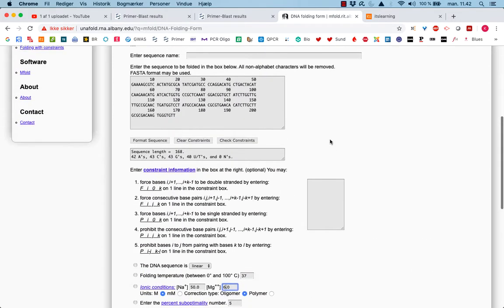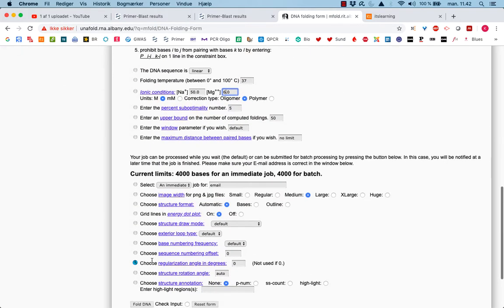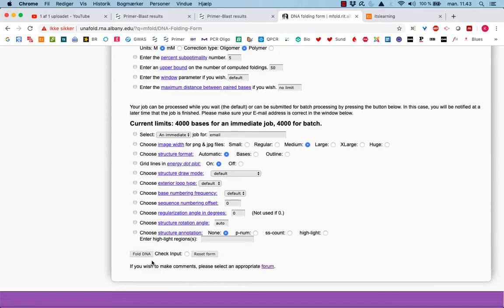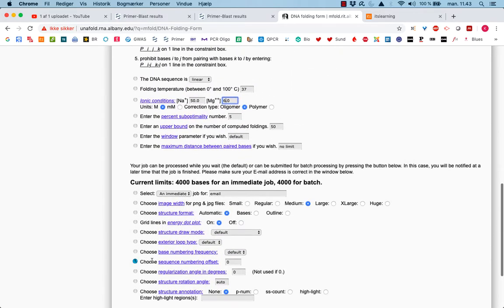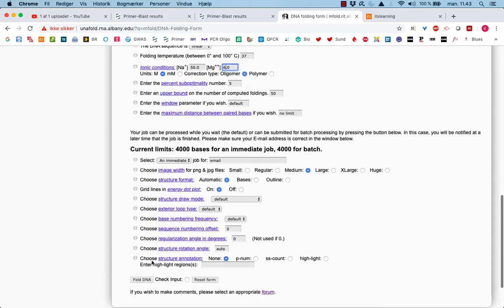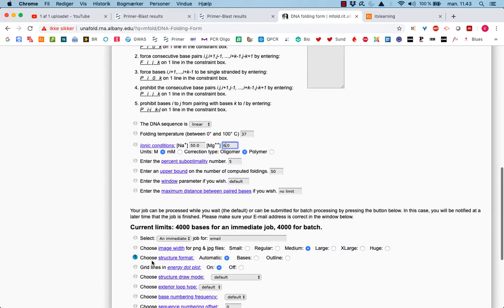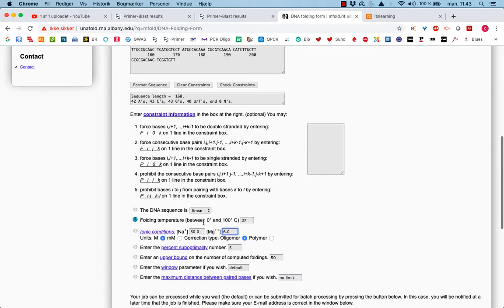And then you can see, you can work with a lot of different factors and variables. And to be fairly honest, I have no clue of most of it. One thing we need to change is we got an annealing temperature, which is 60 degrees for this PCR.